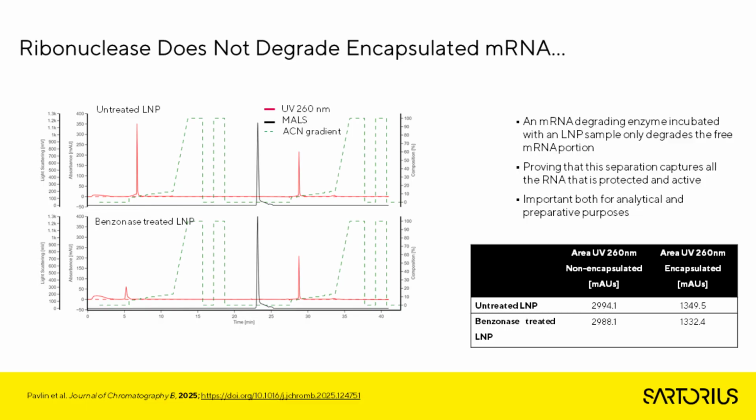So we performed the experiment. We first recorded untreated LNPs, without being exposed to ribonuclease, and we get the chromatogram shown in the upper part of this picture.